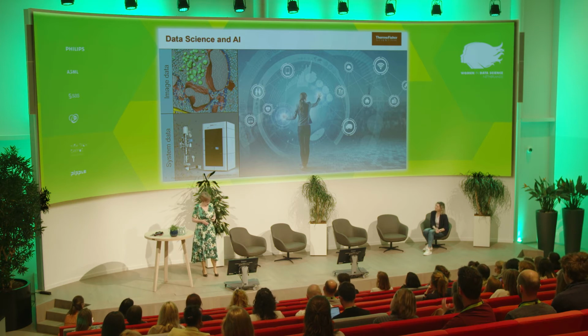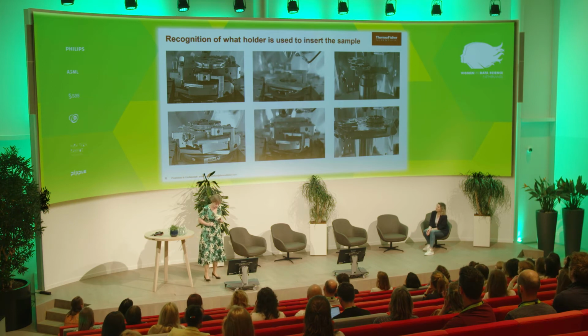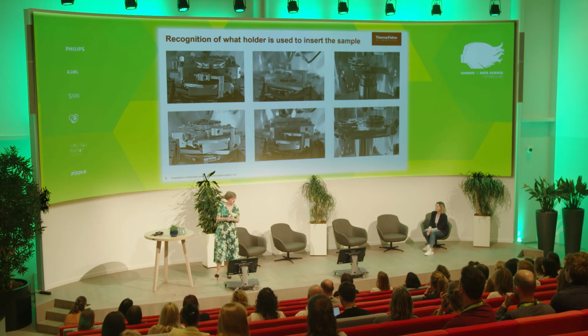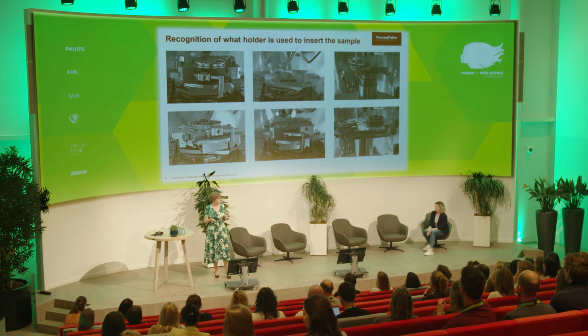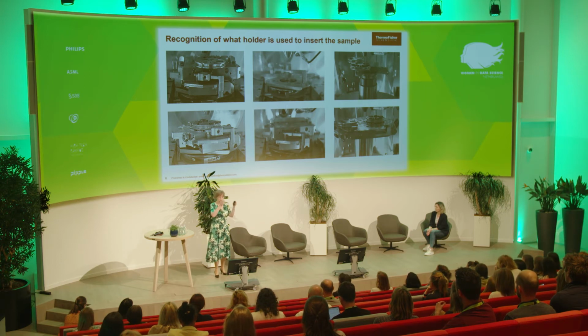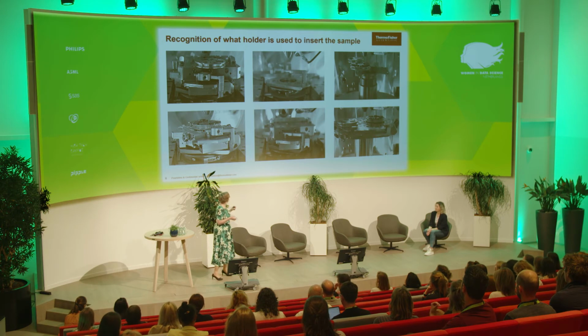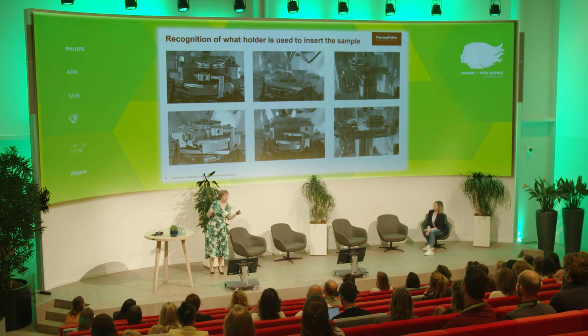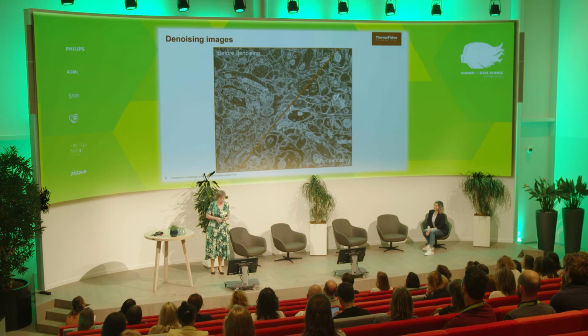So, a few examples. First one, this is an oldie, but it's still a nice one. What you see, probably difficult to figure out, is the inside of a microscope. The way it works is you have to put samples in there to see something about that sample. You can do that through various holders, but it makes a difference which holder you put in, what kind of procedures we will start. So we have automated that simply by looking at the different things that can be on stage. There's even one, the upper one in the middle, that is an empty stage. So it's also important to know that nothing is on it. That's how we did a little bit of automation for our customers with the first steps of machine learning, actually, in this case.